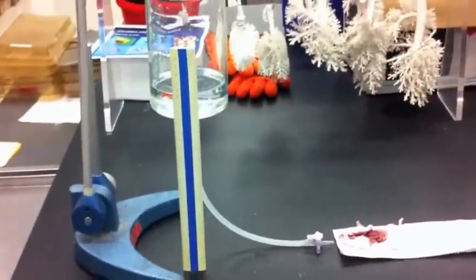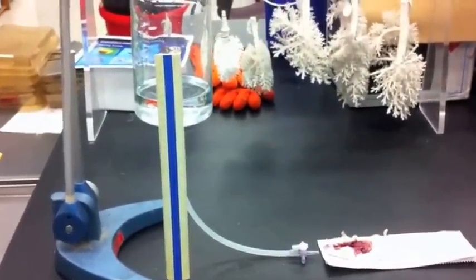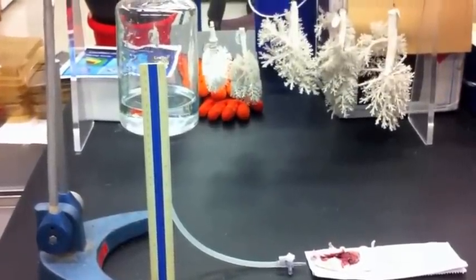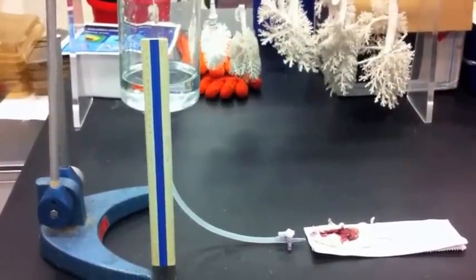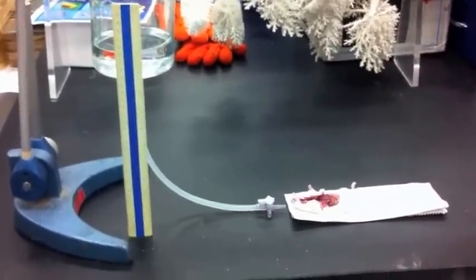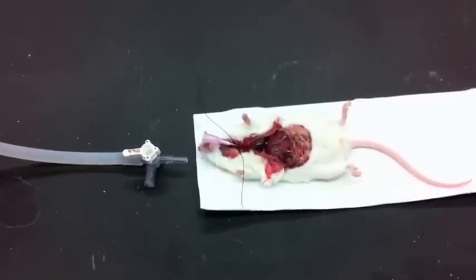We just have a ring stand with the fixative, and we've measured the height above the mouse to be about 25 centimeters of water with a ruler. The actual magnitude doesn't have to be exactly 25 — there can be a little variation — as long as it's the same in all the mice.